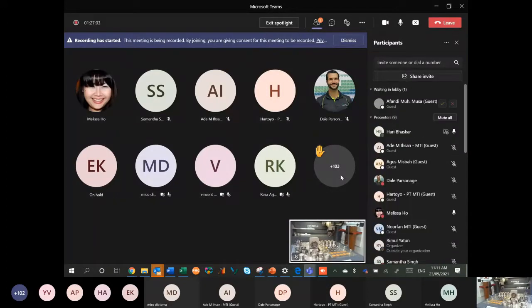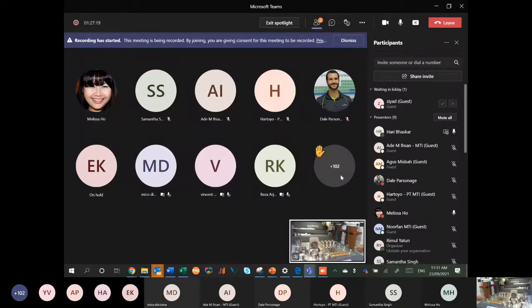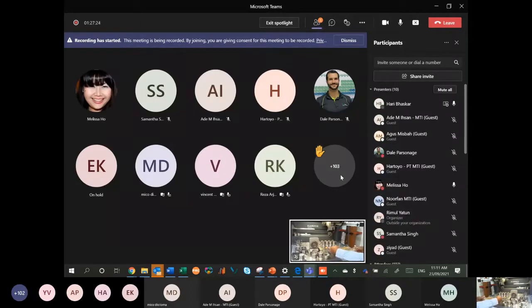Right. So here you can see the front portion basically has the cups which can be used for loading the samples. On this side where the sample trays are present, there are different types of sample trays. Over here I've got a sample tray with 40 millimeter pressed powder samples, direct samples sitting on the tray, and another tray with a smaller size.